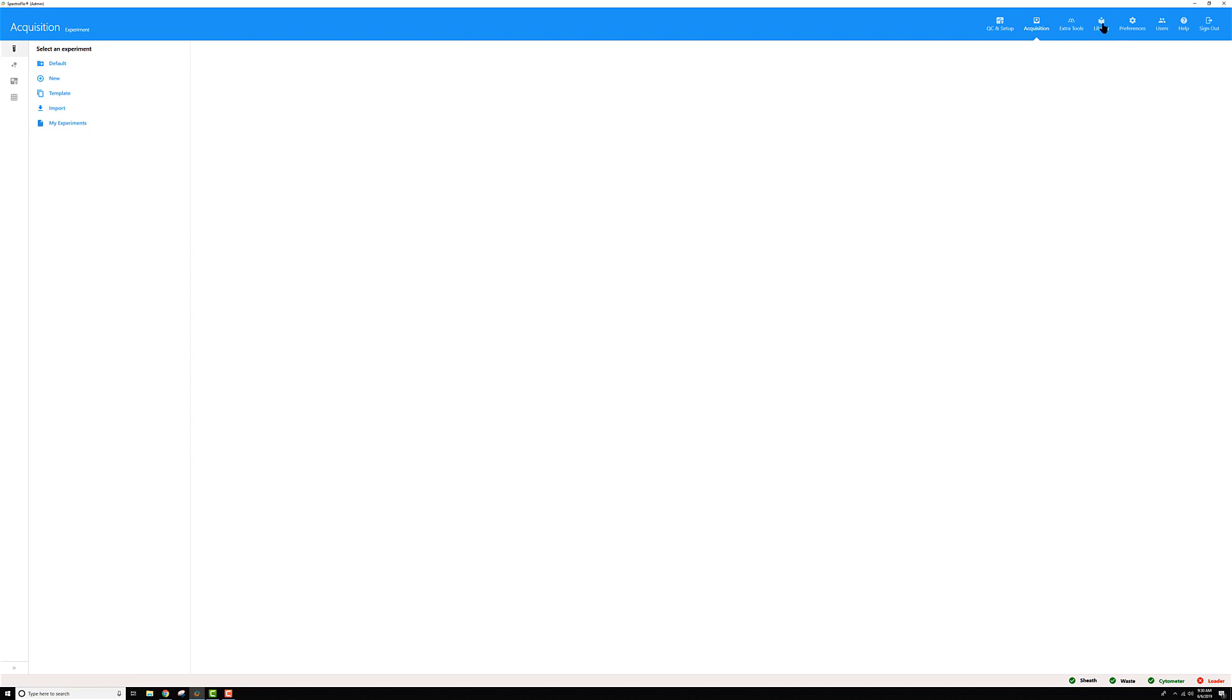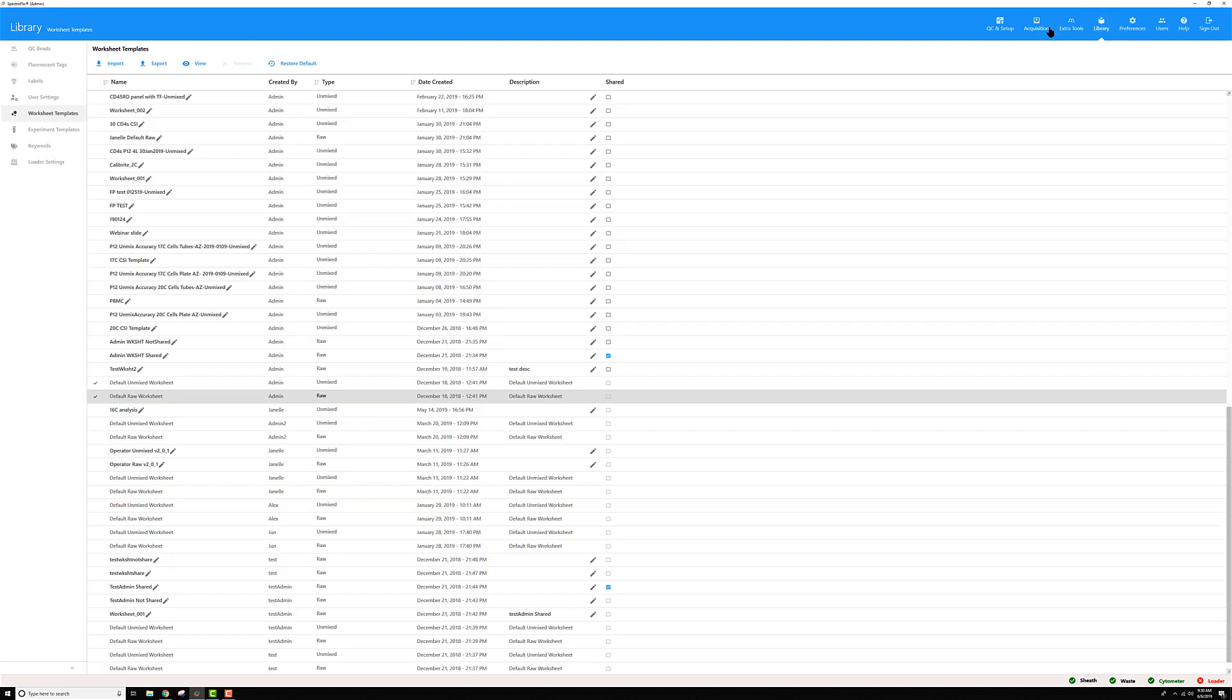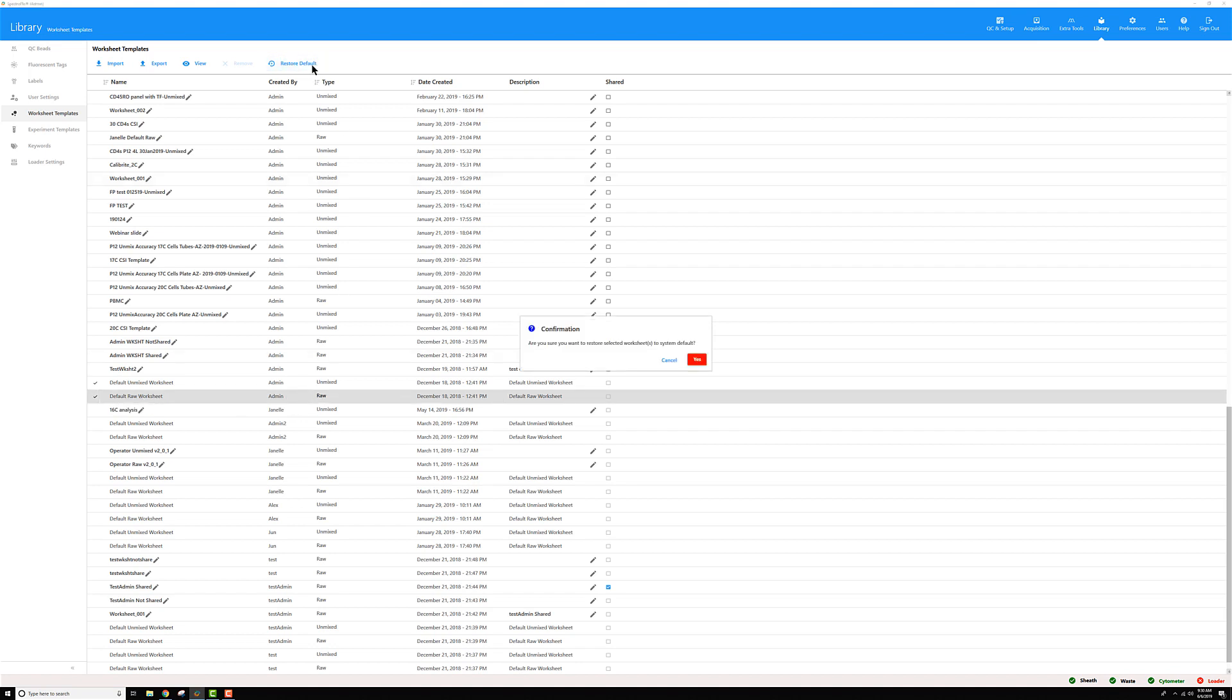Then let's repeat that and go back to the library, select the default raw worksheet made by me the admin, restore default. You'll get this pop-up asking if you're sure you want to restore it. Yes I am.